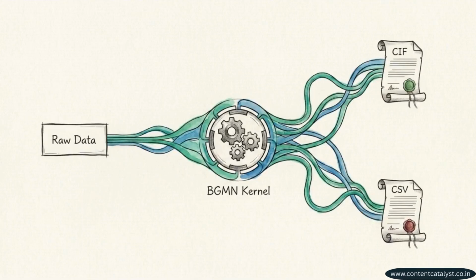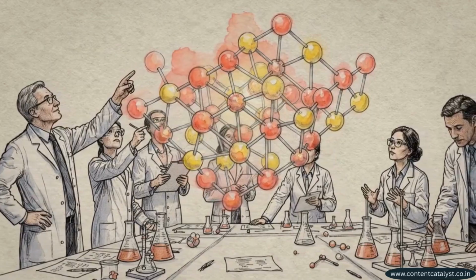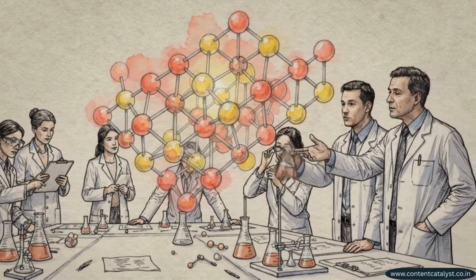Results need to be seamlessly exported to standard formats, maintaining an auditable chain of custody from the initial scan to the final structural file. The next generation of materials research will certainly be built on faster detectors and larger datasets, but its scientific validity will rely entirely on our ability to turn that complex diffraction data into a transparent, shareable, and strictly defensible physical truth.